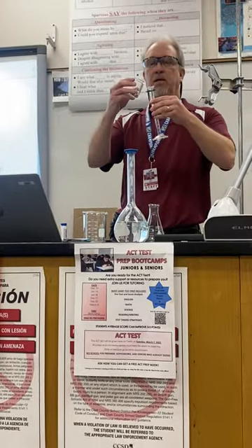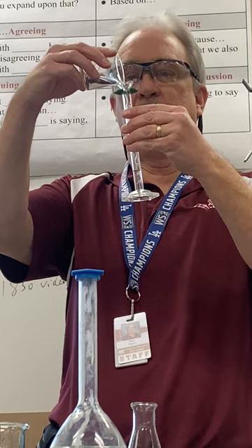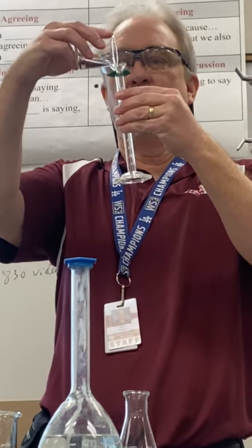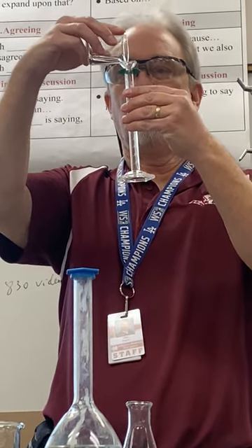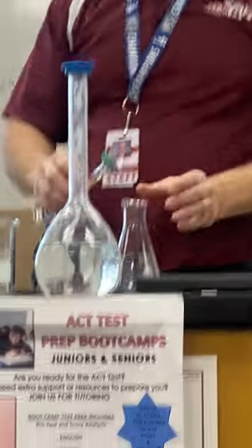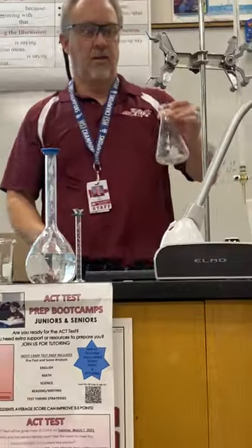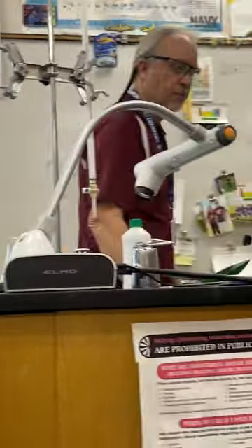So I could measure out, let's say, 10 milliliters of it if I want. So I'll take a graduated cylinder, get it as close to 10 as possible. I'll write down exactly what I get, pour that in there. That's not hardly enough to see.